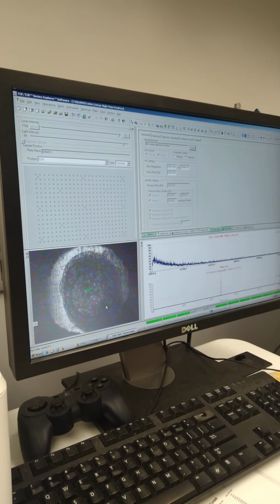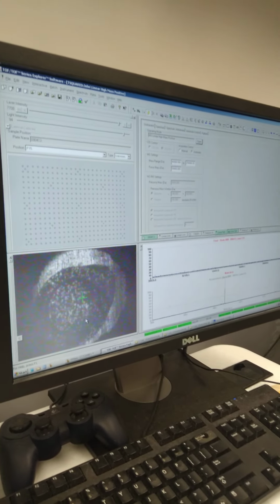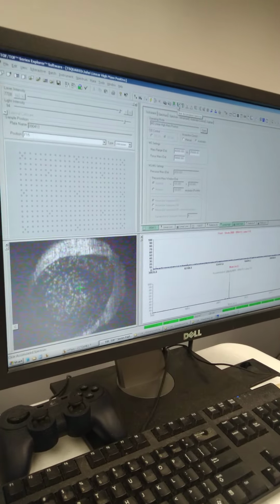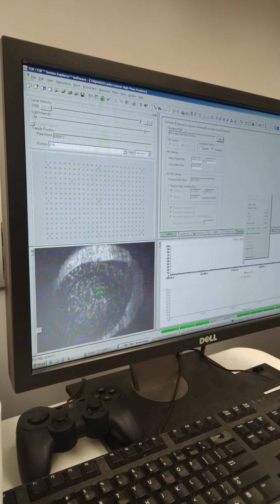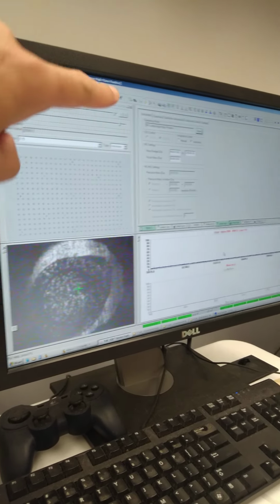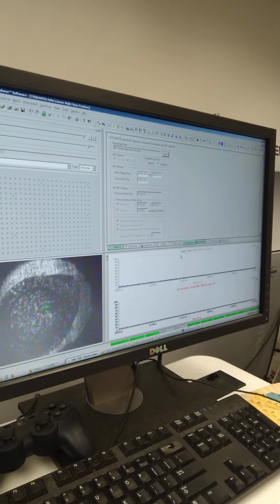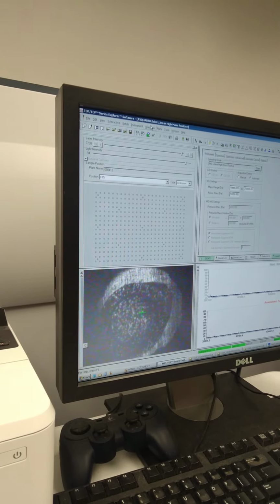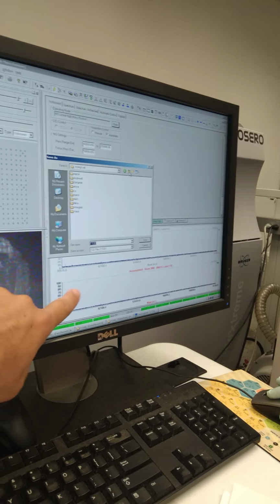All right, and so that's how you fire the laser. And so even though we didn't get anything, go ahead and practice clearing the accumulated spectrum, the peptide data. Clear that one, and then go ahead and click back on the top spectrum and practice adding that into your accumulated sum. So that would be the sum button right there, and that's how you would build an accumulated spectrum. You don't need to save it, but we can make yourself a folder. Go to Spectrum, save Spectrum to File, and make sure that you're clicked on the one you want to save, so the accumulated one.